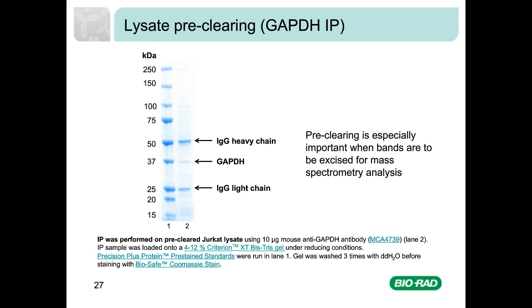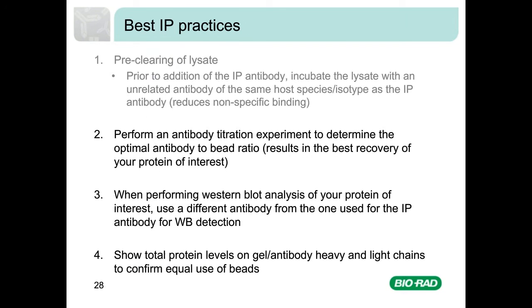Another best IP practice I would like to discuss is the titration of your IP antibody. Titrations are essential to determine the optimal amount of antibody to use. This ensures the best recovery of your protein of interest.